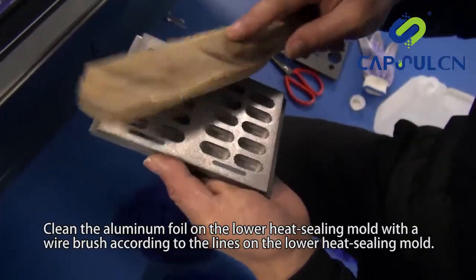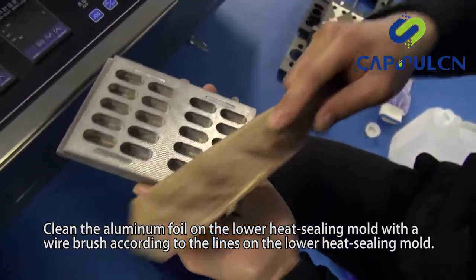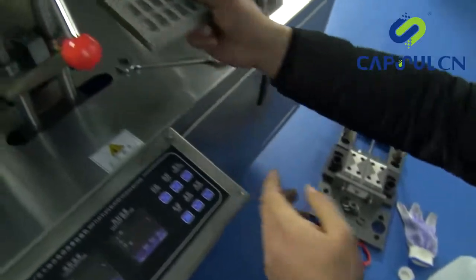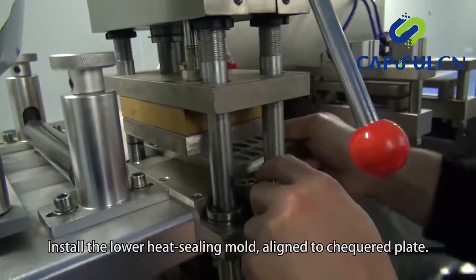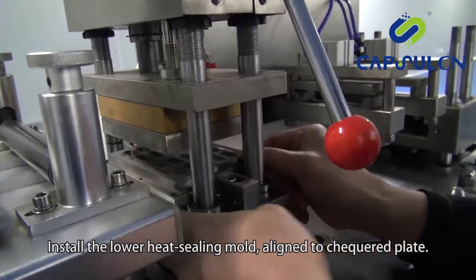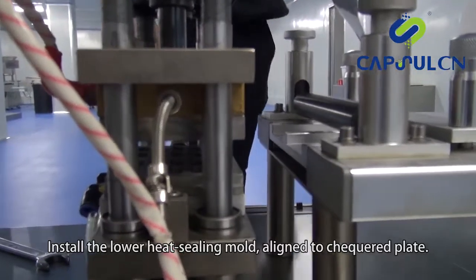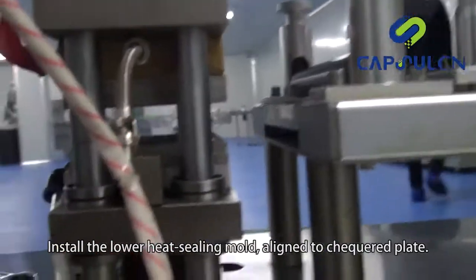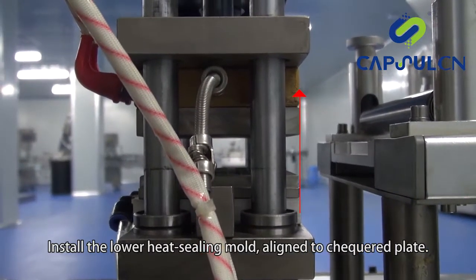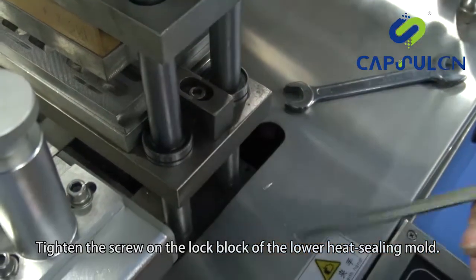Clean the aluminum foil on the lower heat sealing mold with a wire brush according to the lines on the lower heat sealing mold. Install the lower heat sealing mold, aligned to the checkered plate. Tighten the screw on the lock block of the lower heat sealing mold.